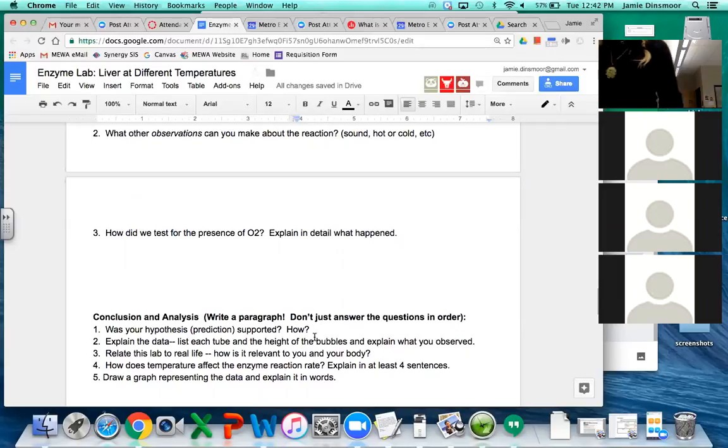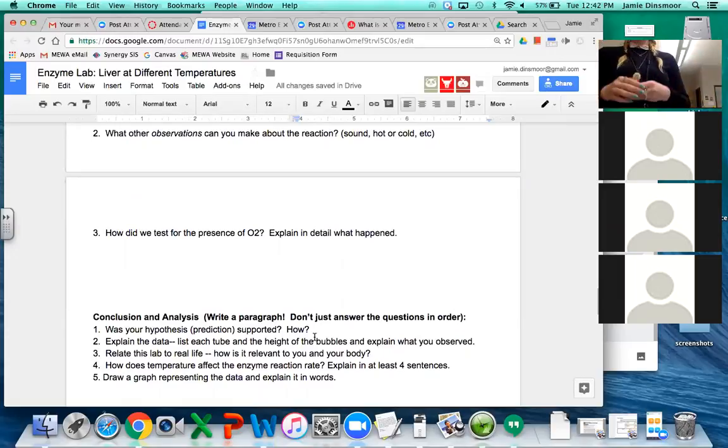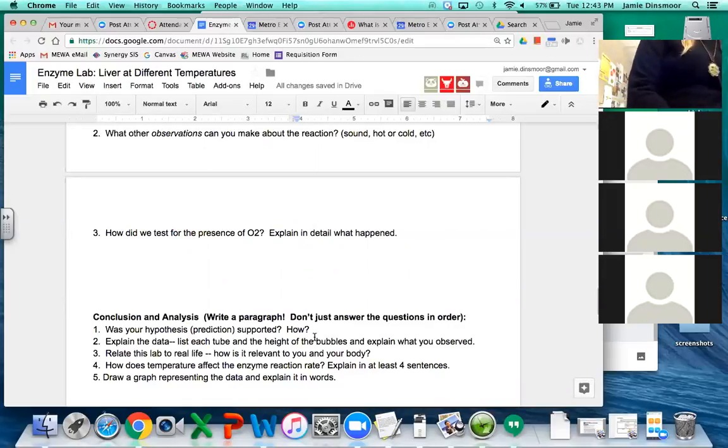What we're going to do is take some liver and put it in this beaker and pour hydrogen peroxide on it. And we're going to take an ember. So I'm going to light the stick on fire, blow it out so there's just that tiny little ember. And if we hold it over the reaction, it should light on fire again. That's cool, right? Because what does fire need? It needs oxygen.